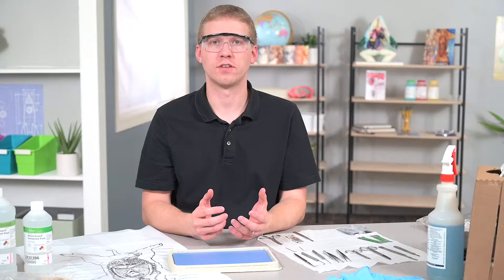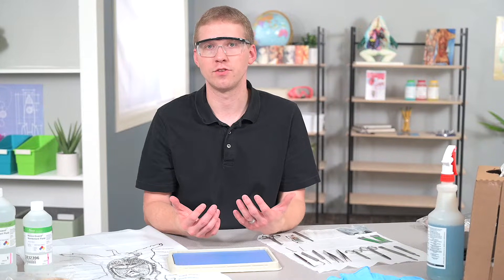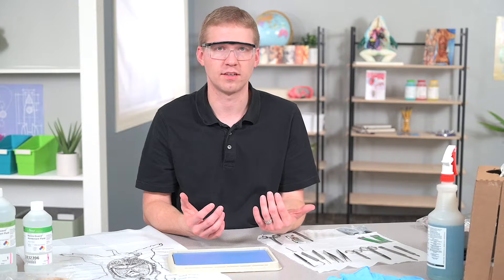When setting up your workspace for dissection, safety is a major concern. I'm going to cover the basic tools and different techniques you can use to ensure safety and complete a successful dissection.